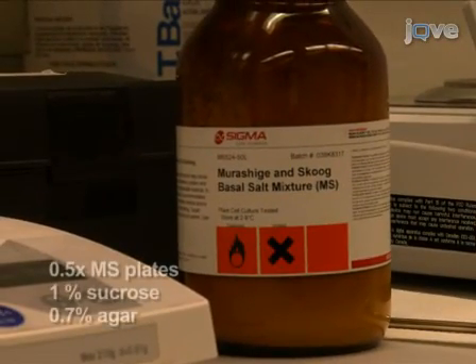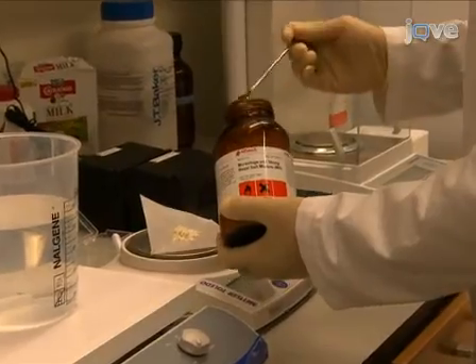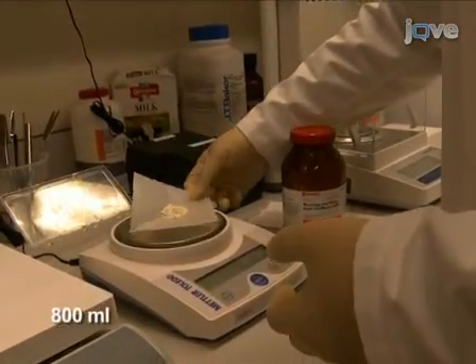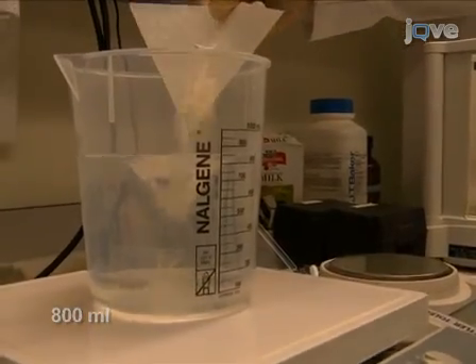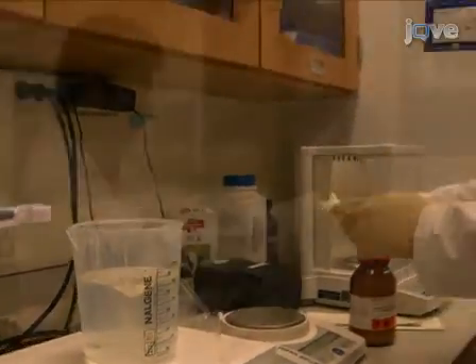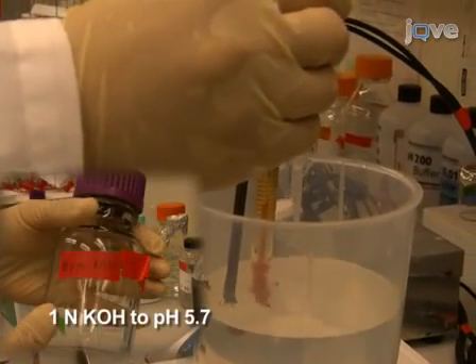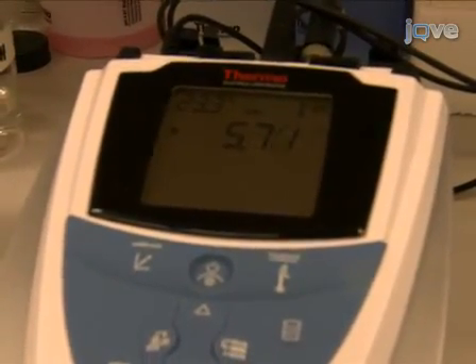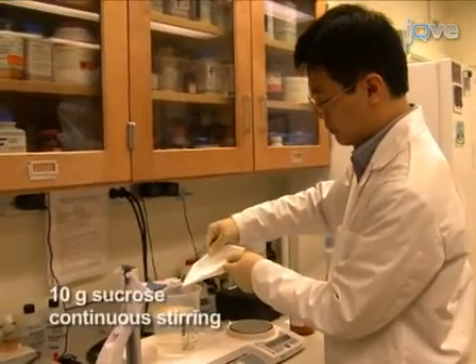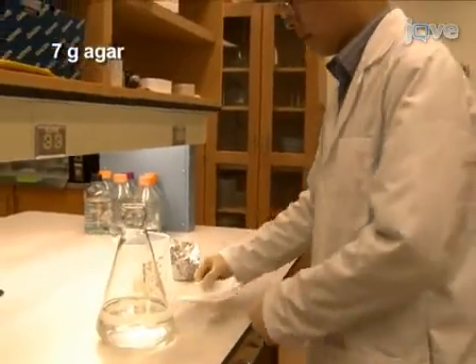We start the procedure by preparing 0.5x MS plates supplemented with 1% sucrose and 0.7% agar. For one liter of medium, weigh out 2.15 grams of MS powder and add it into 800 milliliters of water in a 1.5-liter autoclavable bottle with a stir bar. Stir the medium on a stirring plate to dissolve the powder. While stirring, add drop-by-drop 1N potassium hydroxide to adjust the pH to 5.7. Continue stirring and add 10 grams of sucrose.